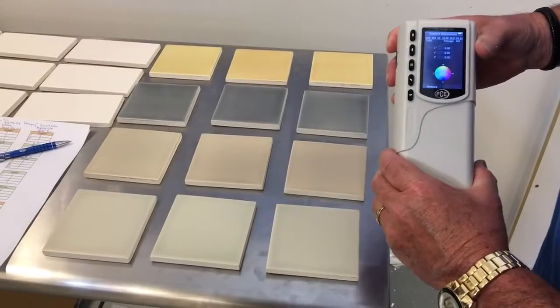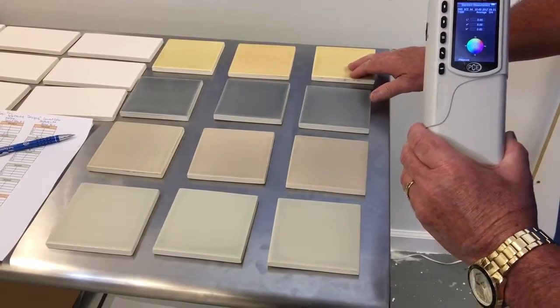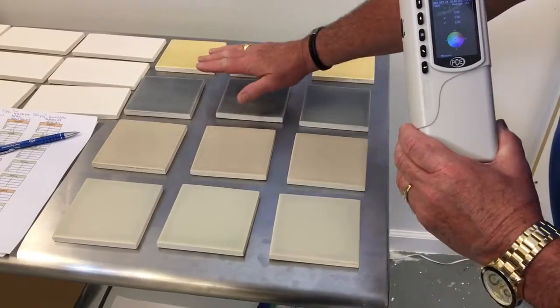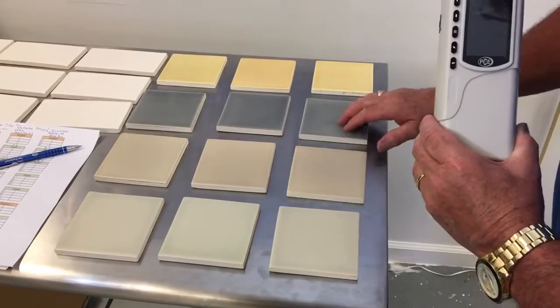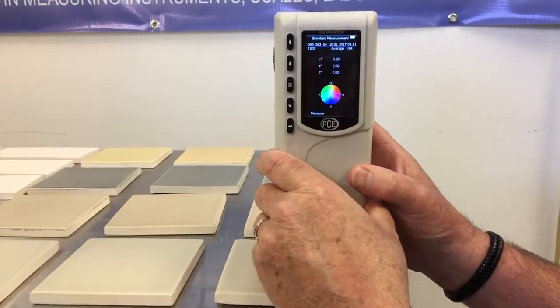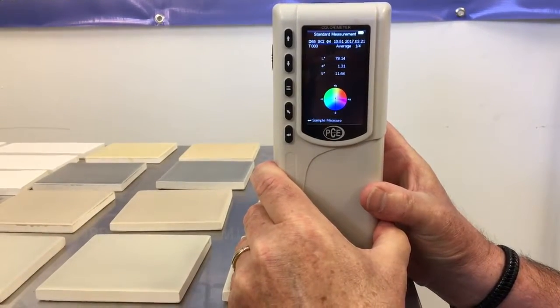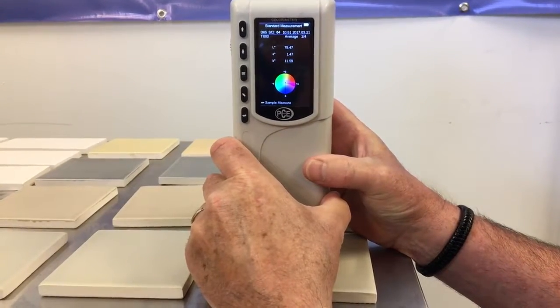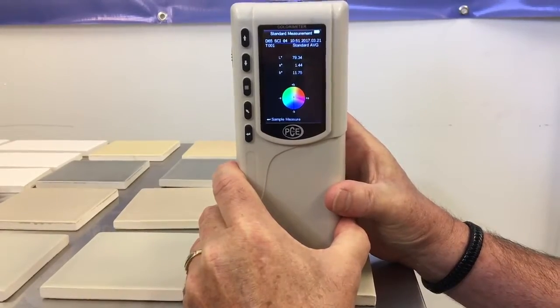We are ready to start our sample measurement. We want all four of these tiles to be the standard for each of these colors. These are all going to be the samples and we'll find out if they pass or fail according to the color of these standard colors we're going to be setting up. We're going to do it four times: one, two, three, four. Our average is set for our standard.